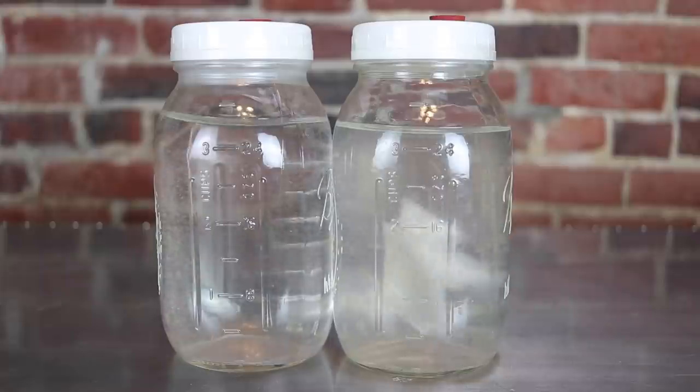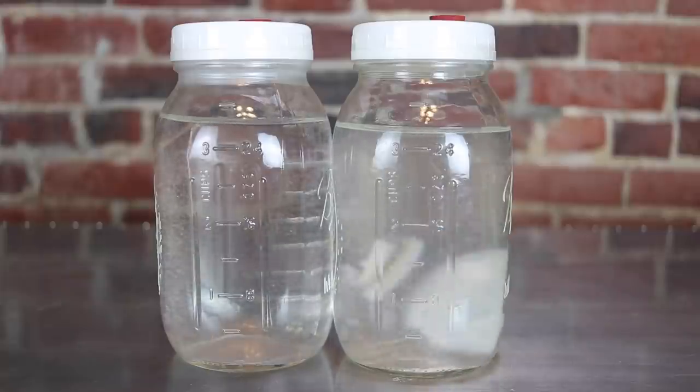One of the things we all have to deal with that is extremely frustrating in mycology mushroom cultivation is contamination. One of the worst things that could possibly happen is you spend a ton of time and energy making some really nice master LCs, test them out, they work great, they look beautiful just like this one right here. You use it a couple times and then on the third or fourth time everything's contaminated. We're going to talk about how you could protect your LCs from ever contaminating so you don't run into this issue.